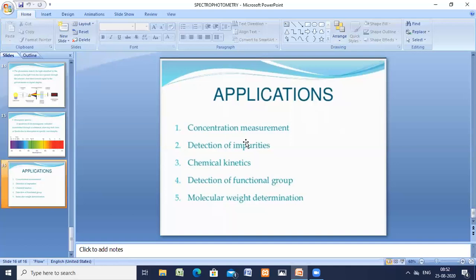That is one example for concentration measurements. Now we'll see the second example, manganese and manganese sulfate.